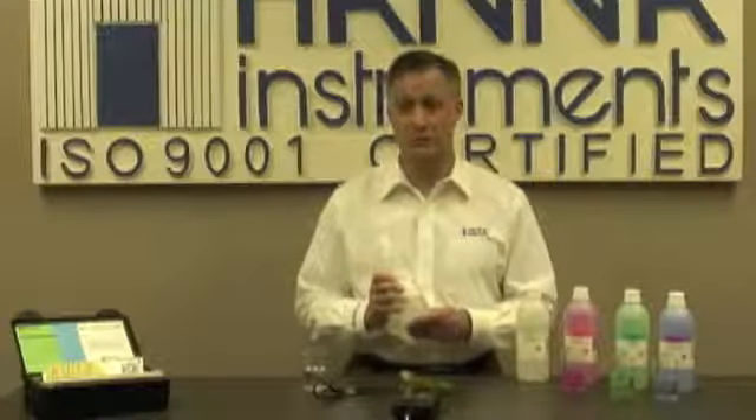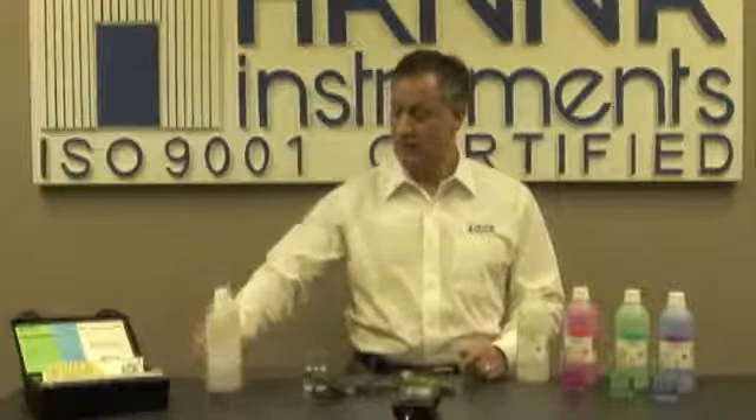In the event that you ever have drifting or erratic readings, it could be an indication that your probe is dirty. We offer cleaning solutions as well. I hope you enjoyed my demonstration of the HI-8314. If you have any questions or need additional support, please contact your local Hanna office. Thank you very much.